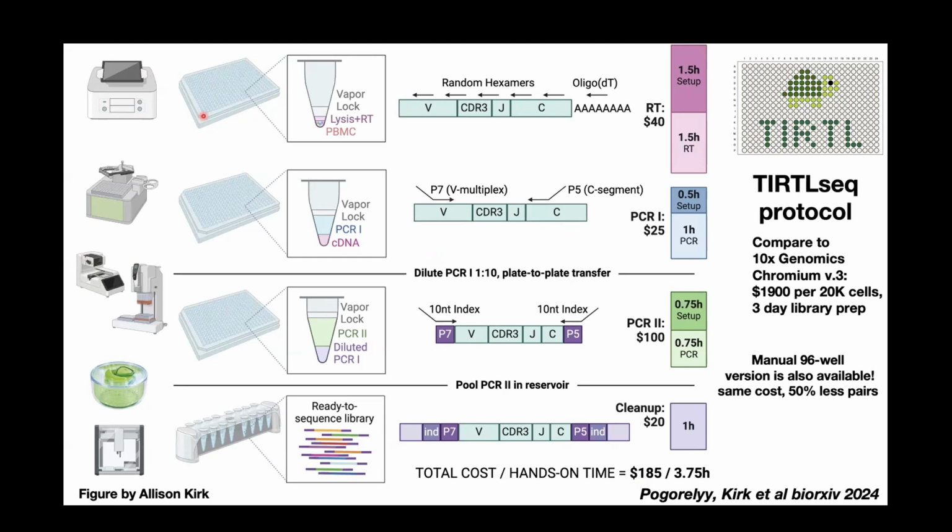From a molecular biology perspective, you have this 384-well plate. In each well, there is a lysis and RT solution, and you load cells directly. So there is no extraction step. You get your cells and you load them directly into these wells. You use a non-contact liquid dispenser for this because a 384-well plate is tough. And with machines, they basically produce small droplets with your reagent and put them into each well.